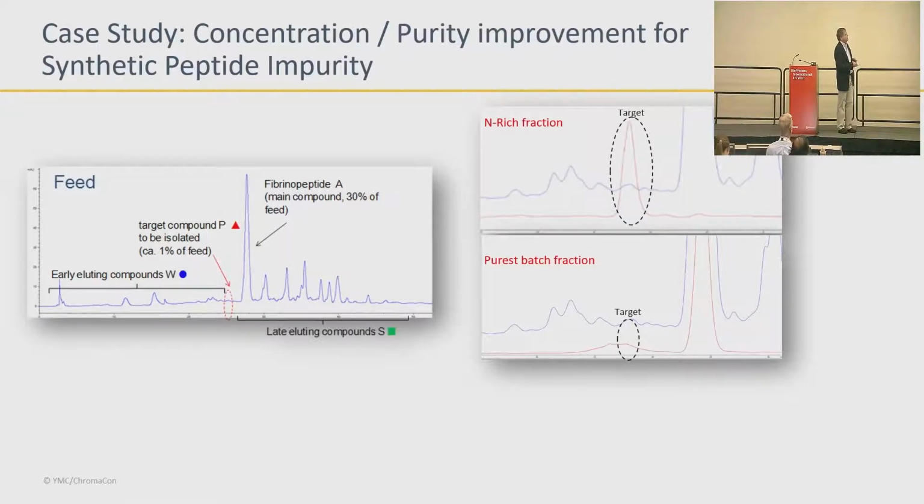So this was the results of the batch chromatography. This was about as good as they could get. Honestly, I think they could have loaded a little bit more, but if they loaded more, it would have been overlapping with that peak right there as they were going through. But when they did the Enrich, and they ran one run at the end without adding more material so that they only caught the early peaks, now they have this giant peak relative to other things.